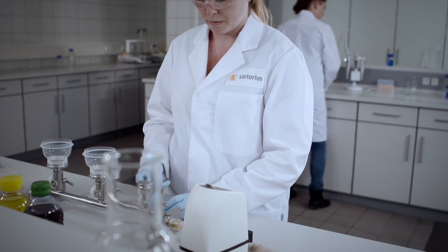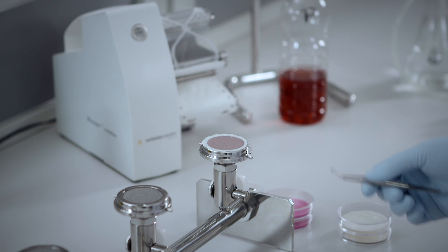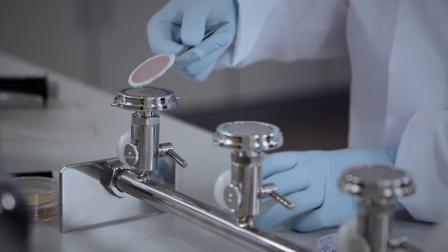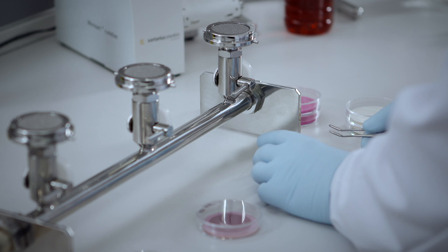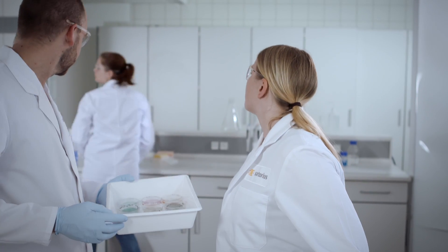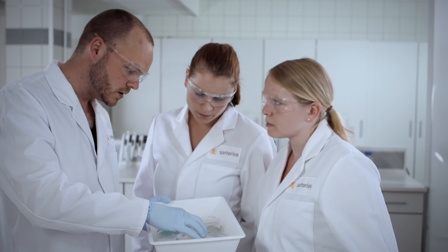Easily remove the membrane filter using the recessed parts of the base fitting the tweezers, and place the filter on the pre-wetted nutrient pad. After incubation, the colonies can be easily quantified due to excellent reproducible results.